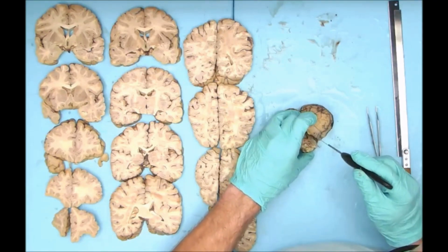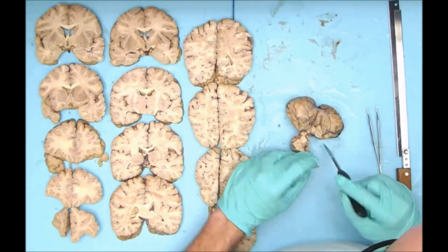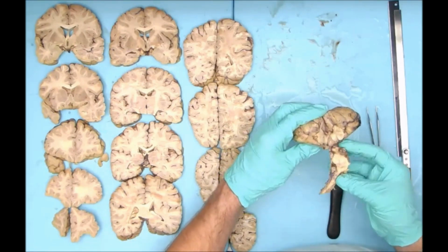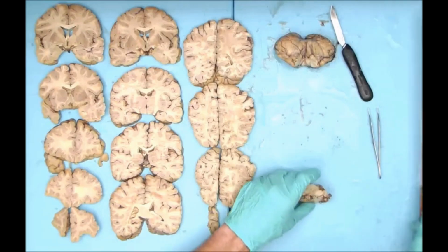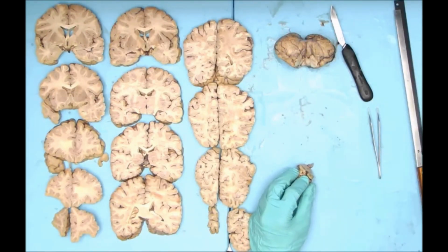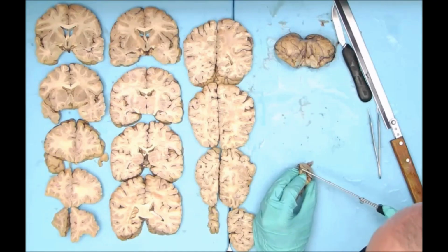So I'm cutting through those peduncles and dividing the brainstem and medulla from the cerebellum. For the brain, I perform coronal sections. The brainstem and medulla, I'm going to perform just transverse sections and put those in chronological order.